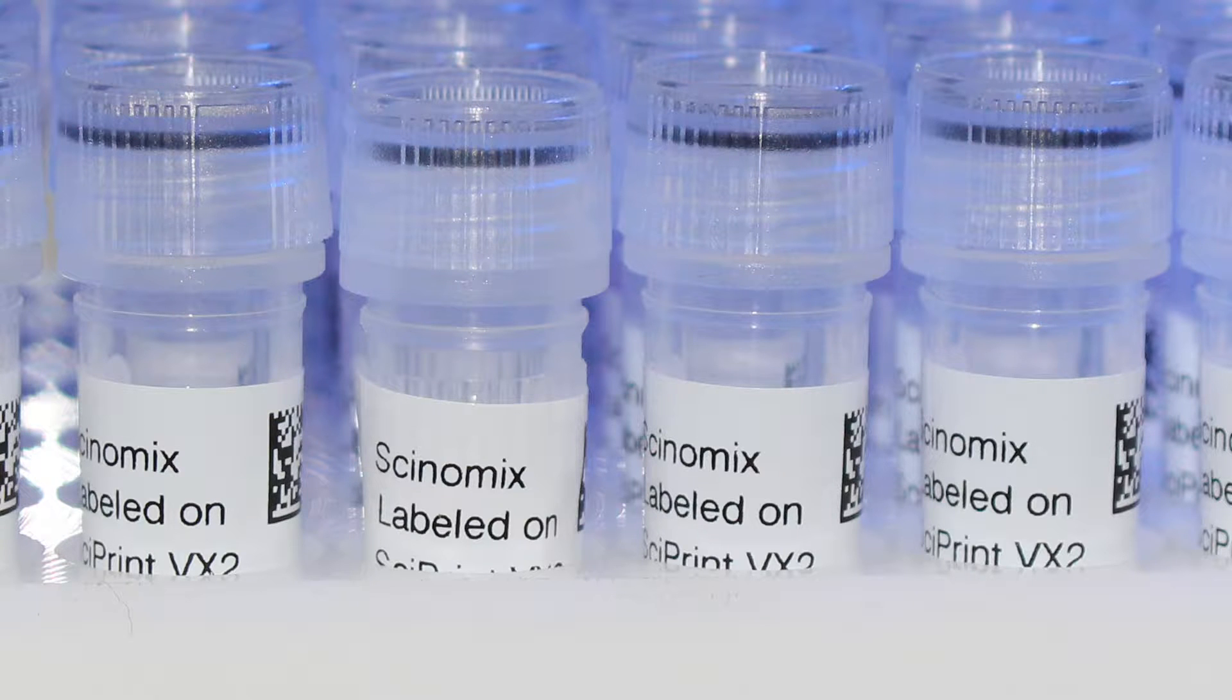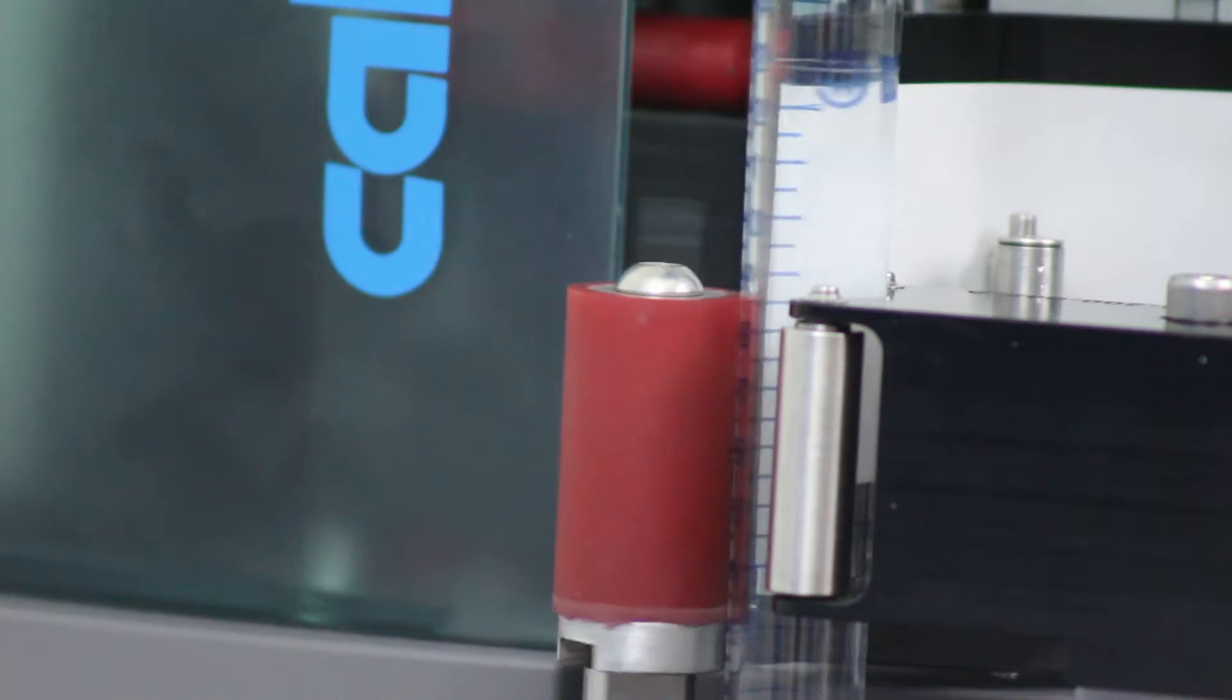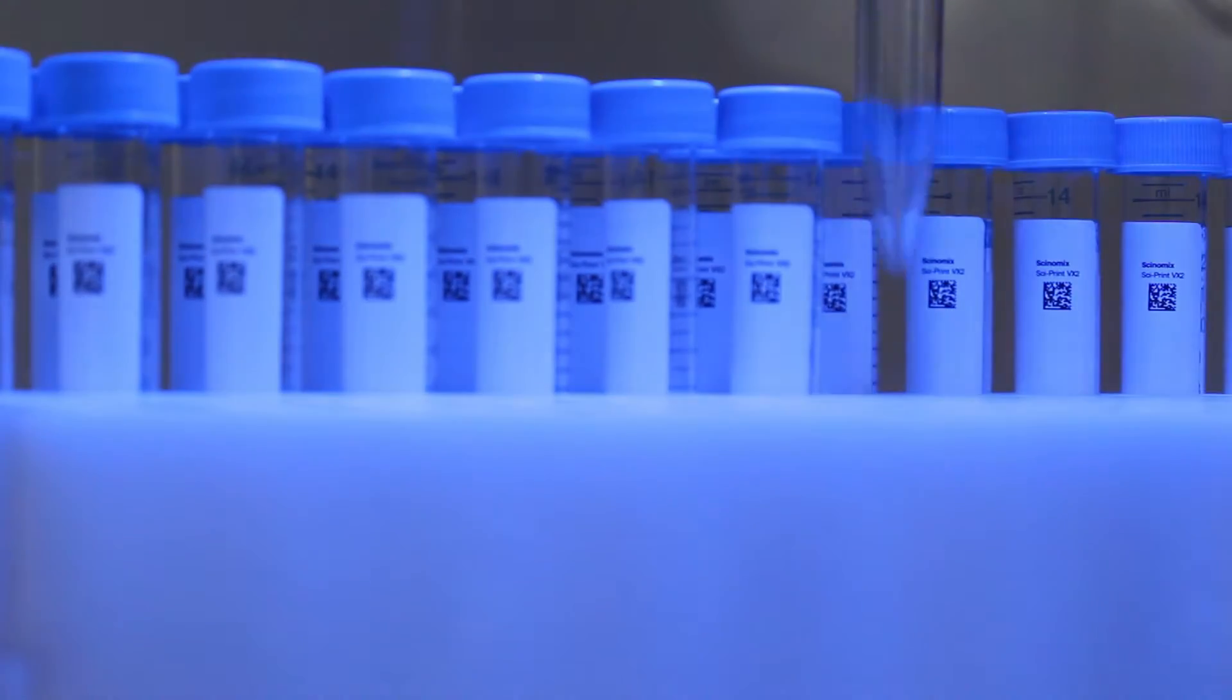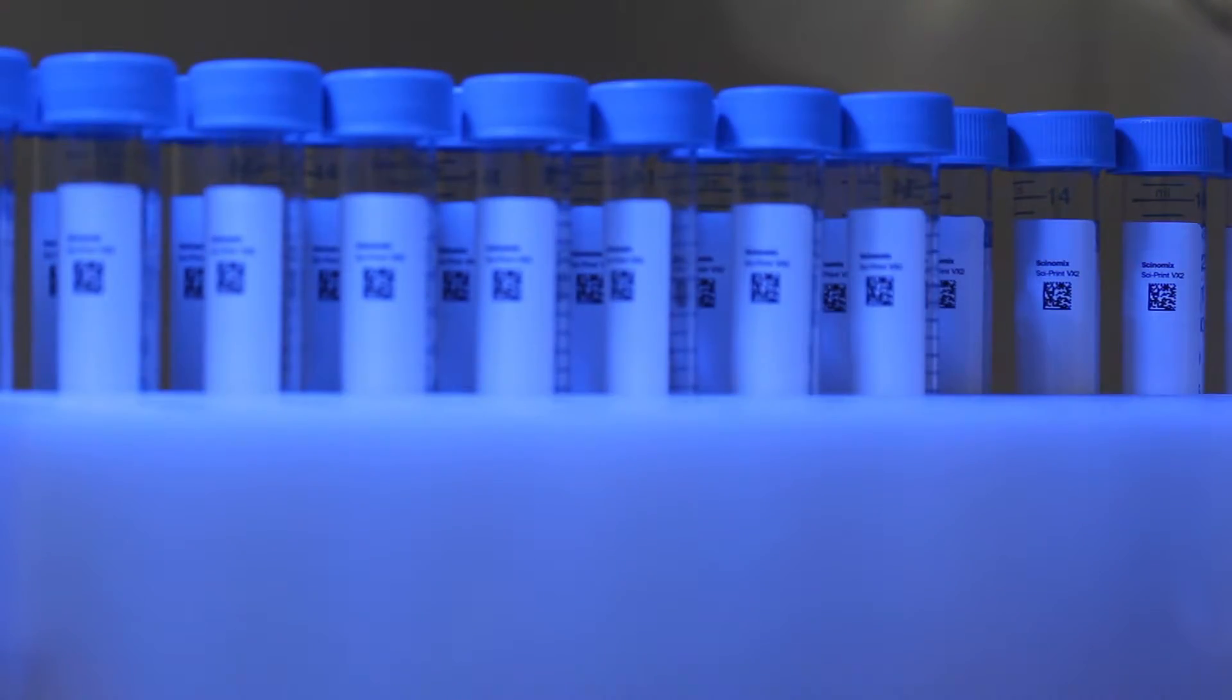Synomics offers many accessories to better optimize your tube labeling. The SciPrint VX series comes with several different label options to help customers achieve individual needs for chemical compatibility, size, and temperatures ranging from negative 196 degrees C to plus 120 degrees C.